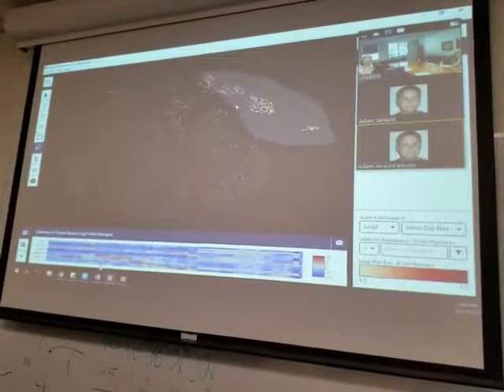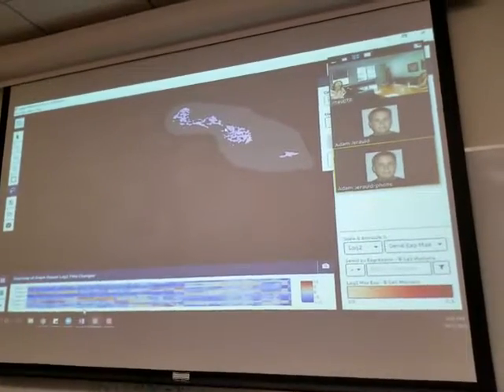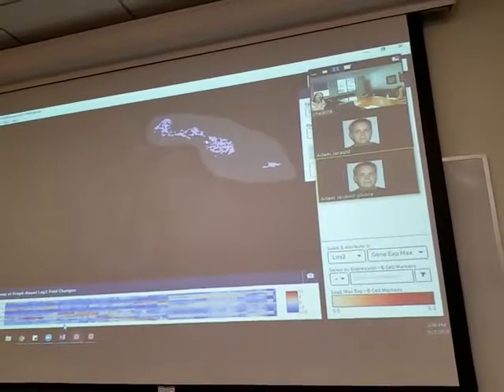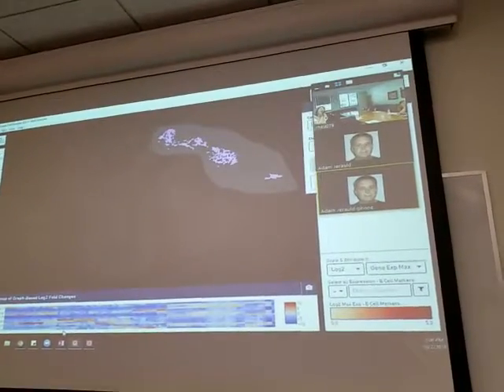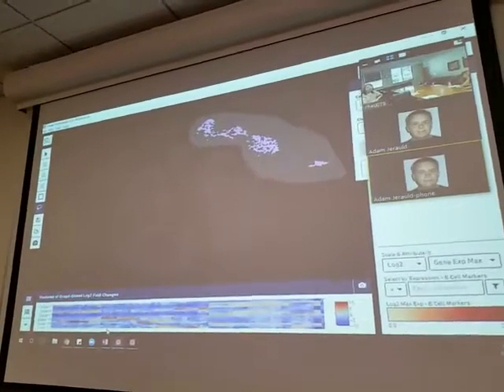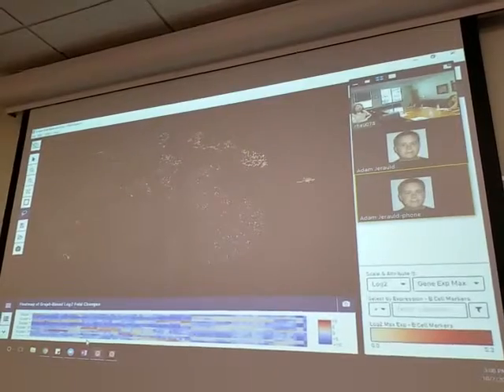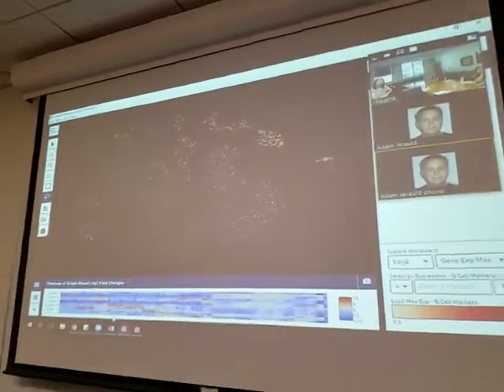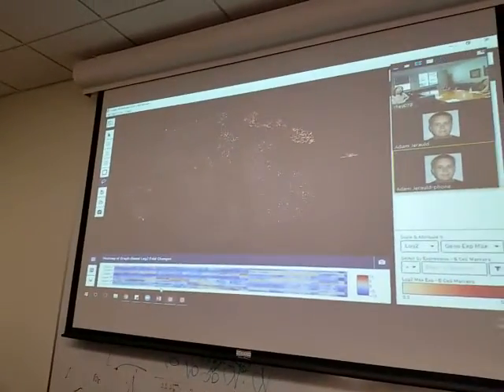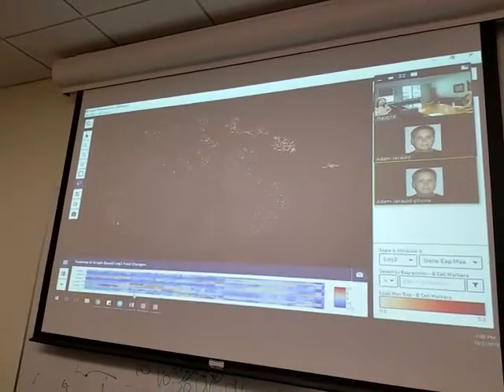I'm using the lasso tool by eye here. Is this a subset that is a particular, is this a gene or a subset, like cluster? I guess it's a cluster. Let's say it's pretty positive for some gene, though. Right. Well, keep in mind, the clustering is driven by all of the genes being expressed. All right. Yeah. So the cluster is already.